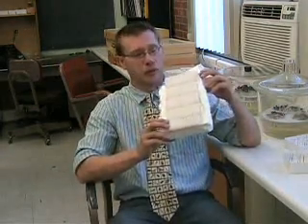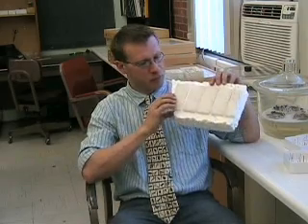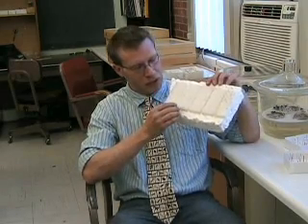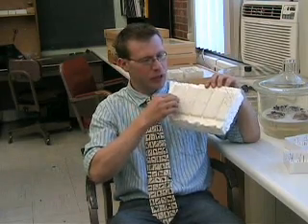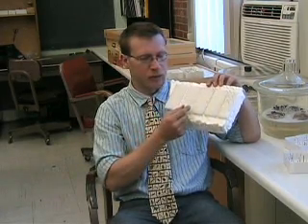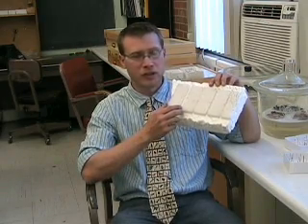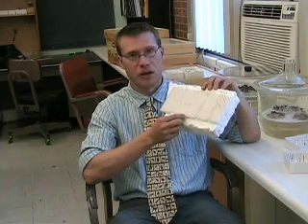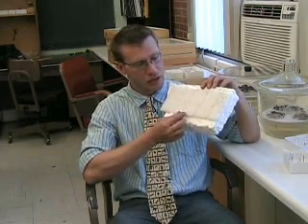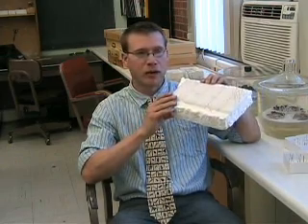You can use styrofoam with little pieces pinned on it, then separate them to the width you want. You can manipulate these pieces to the width of the specimen — if it's something really thick like a sphinx moth, you can spread it out about an inch, or if it's something really small like a noctuid or a geometrid, you can bring these much closer. These are good because they're lightweight and you can put them anywhere.